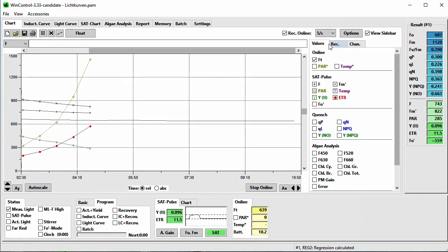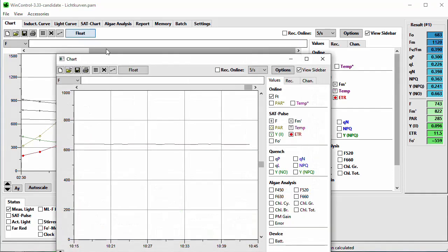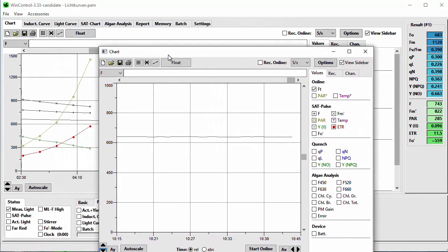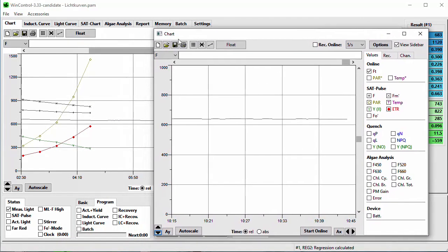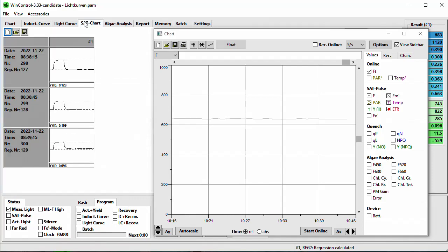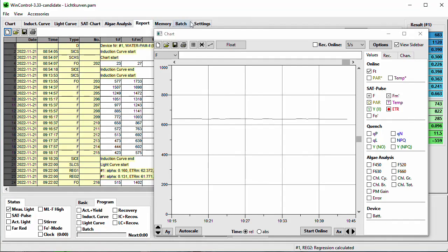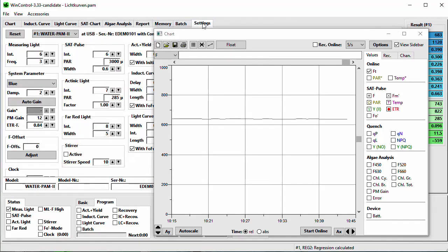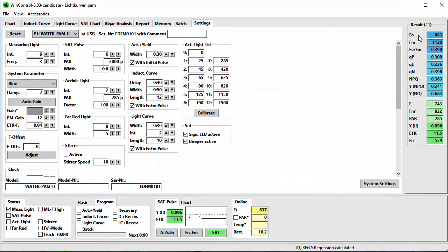The recording can be stopped by pressing Stop Online or unchecking the checkbox. There is another nice feature on the chart tab: the Float button. When you press Float, a duplicate of the chart tab is generated — now you can switch the application tab while still keeping an eye on the experiment. This can be very helpful, for example, when you adjust settings. Closing the float window just ends the duplication of the chart; it will not end any measurement.